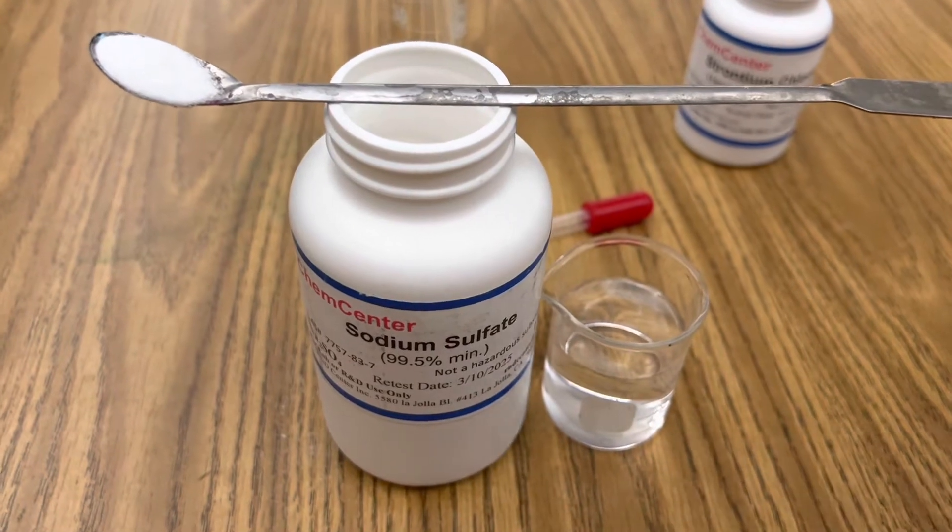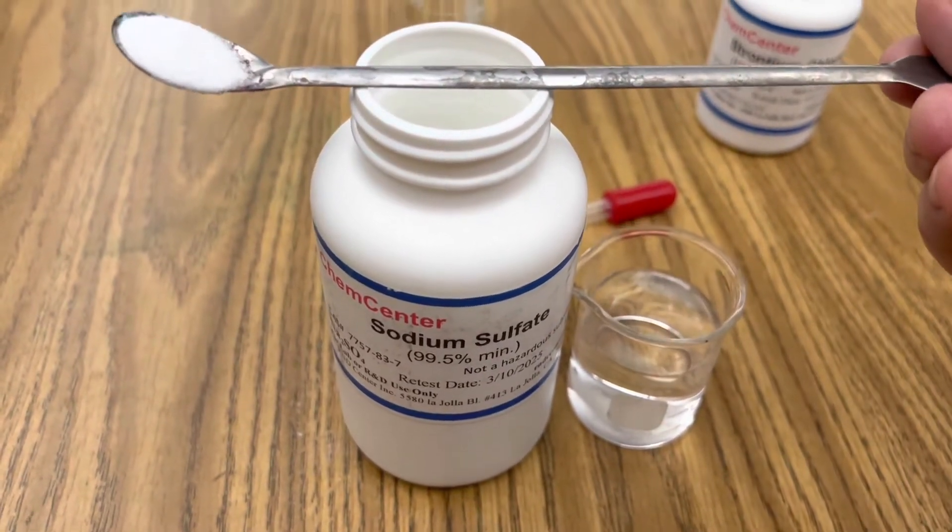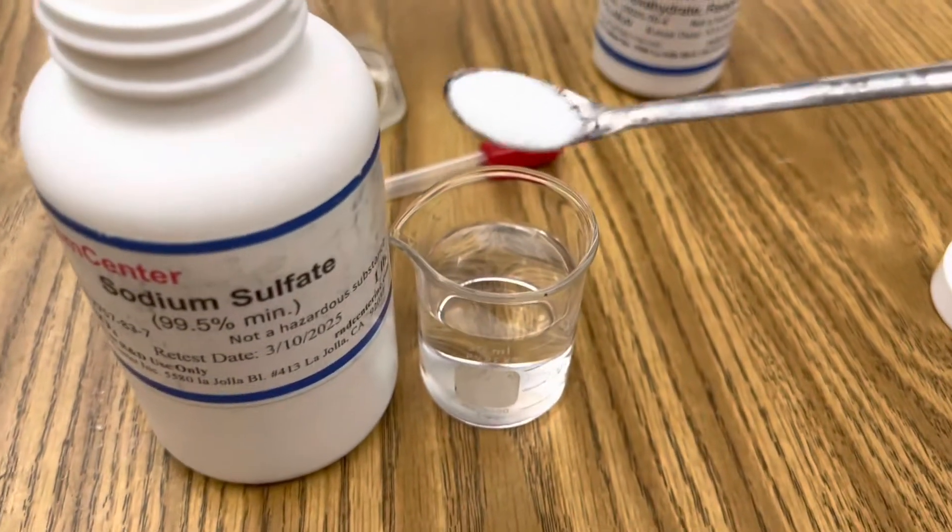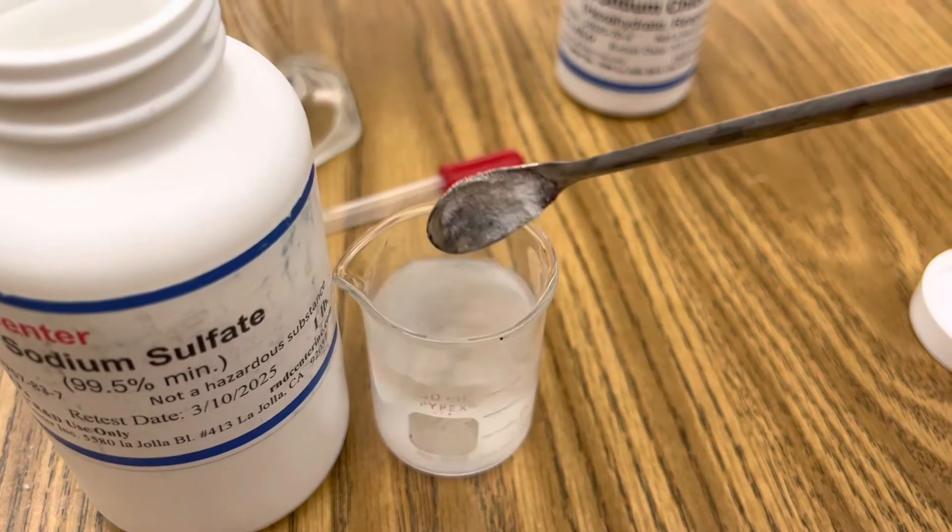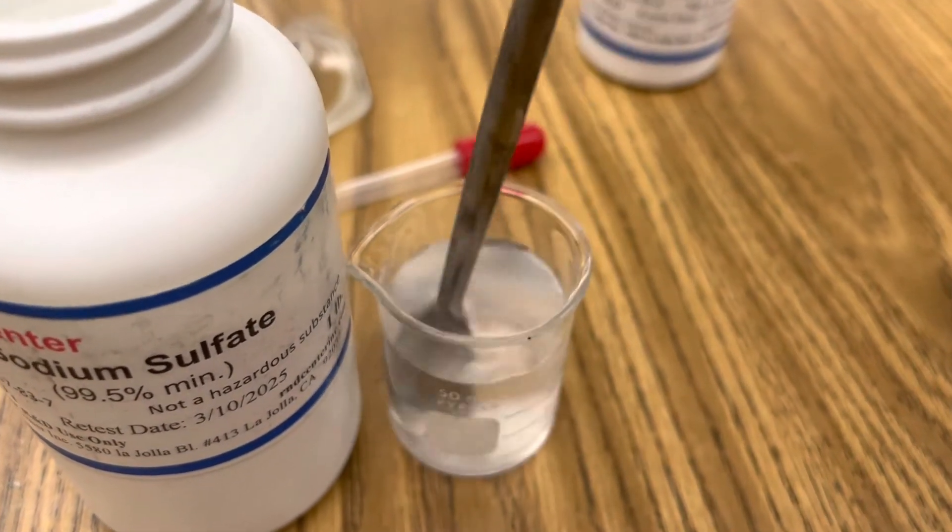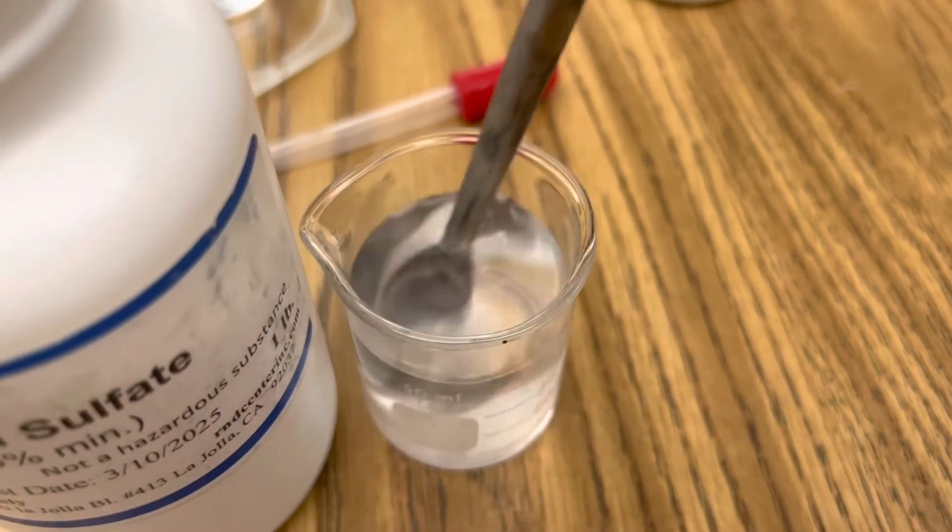Begin by creating an aqueous solution of sodium sulfate by adding 4 grams of sodium sulfate to 40 milliliters of distilled water and stir it until your solution is aqueous.